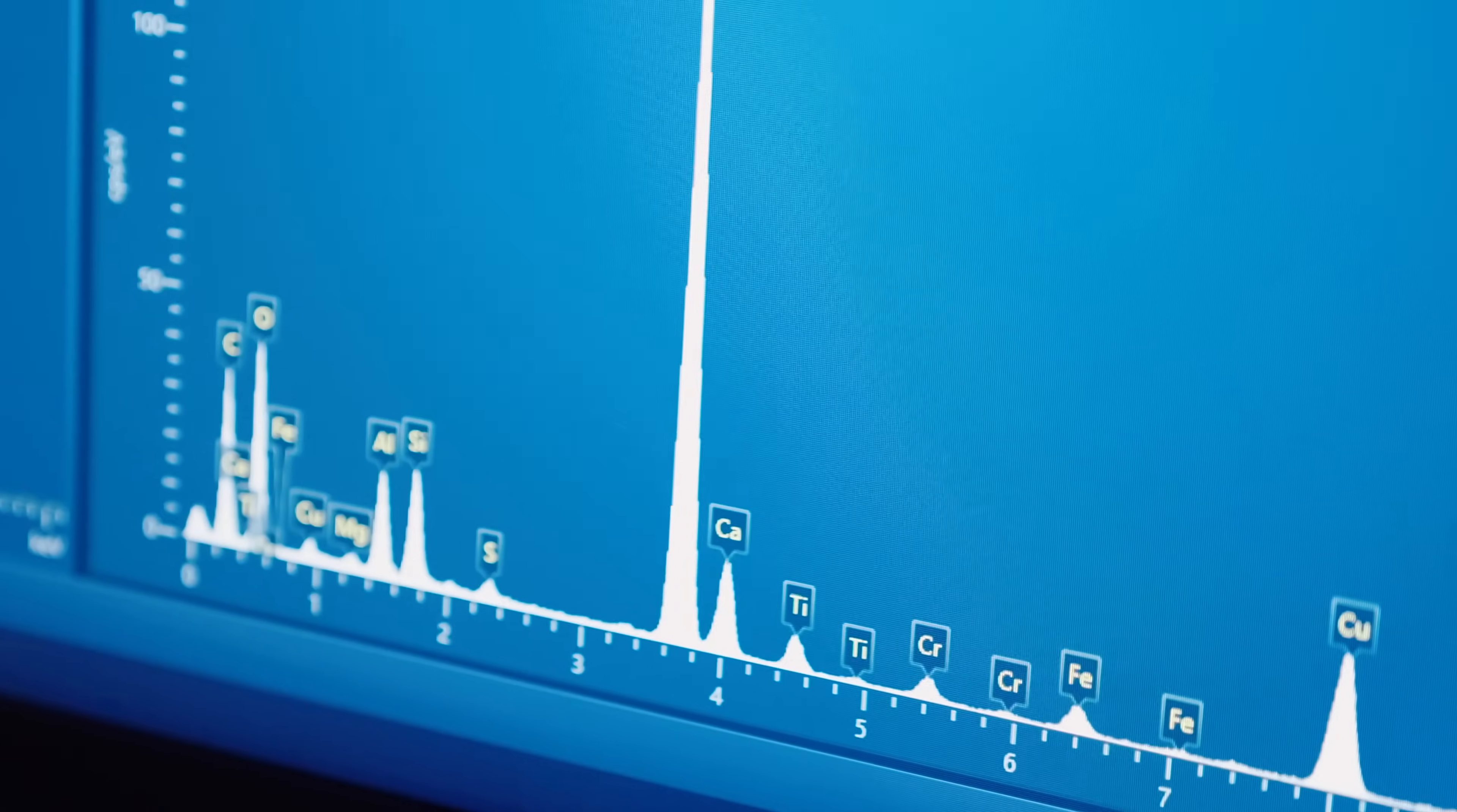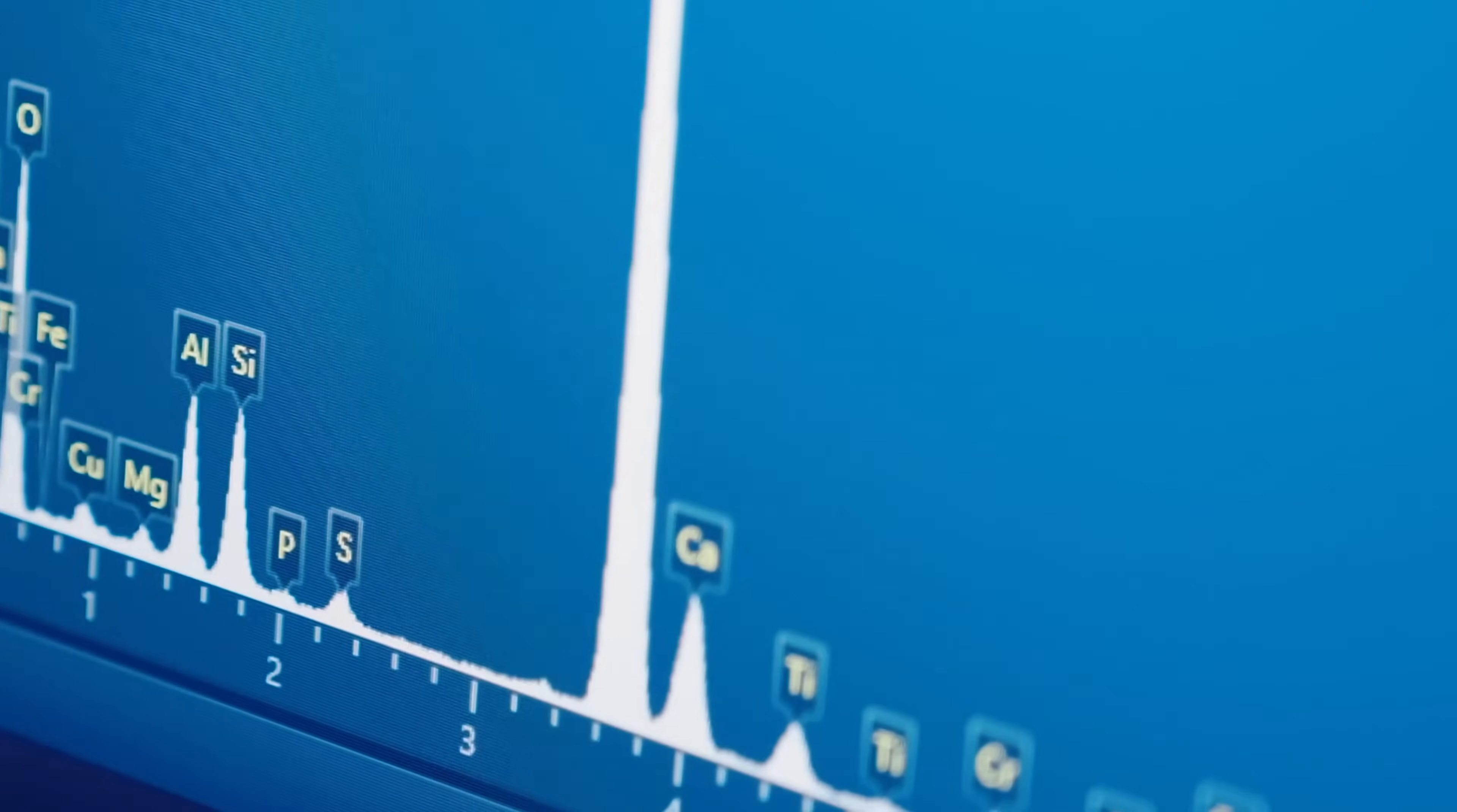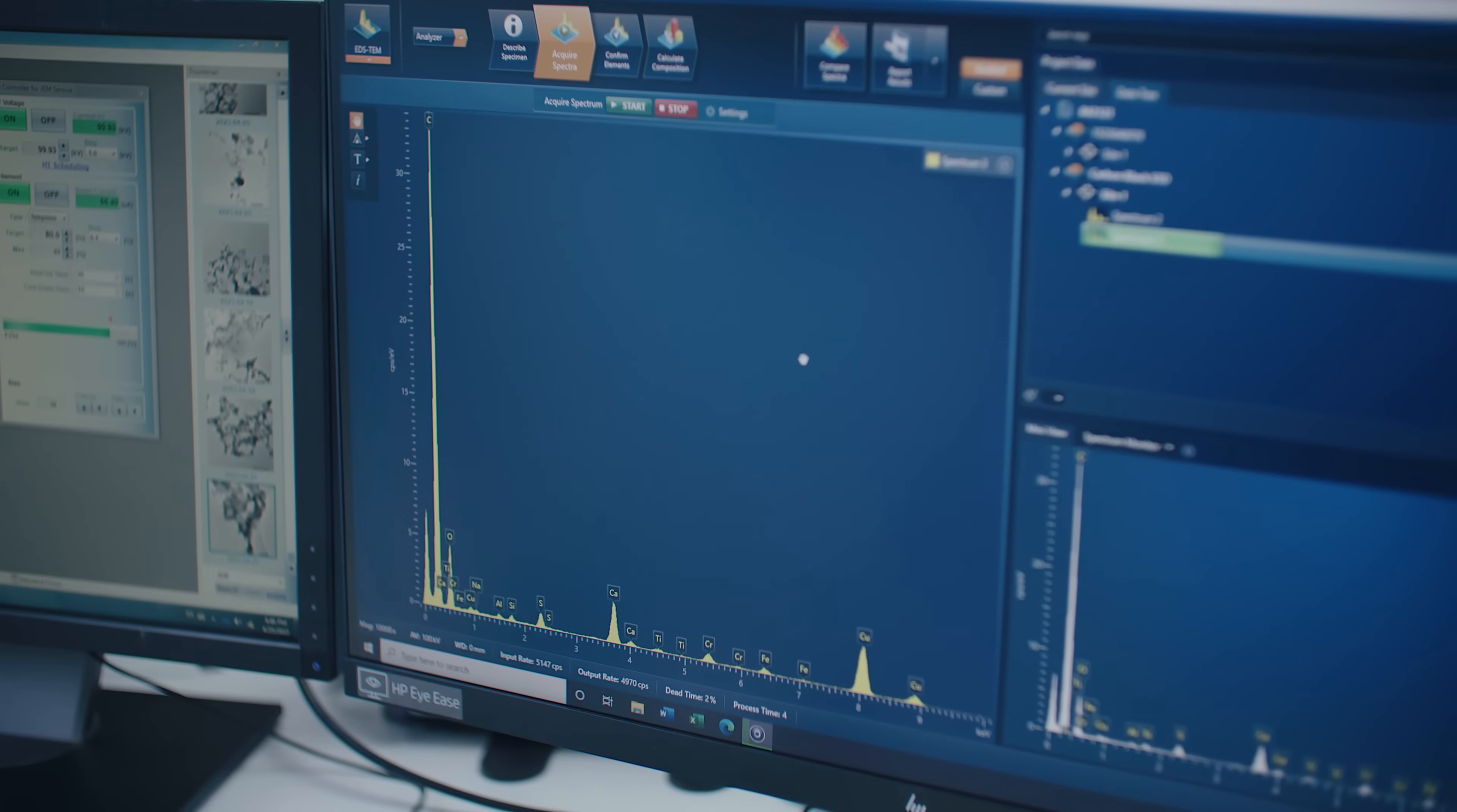Beyond this, we also have this machine over here. This is part of our EDS machine. This machine will insert and be able to read out what elements are present in the sample. So we focus the electron beam on a specific target in our sample and then we've gone ahead and inserted our EDS and then we're analyzing for what element composition we have.